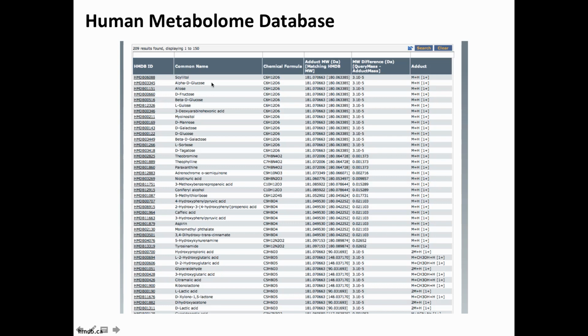Now, using glucose is also a mean compound in that respect, because all the hexoses will have exactly the same molecular weight. So you get plenty of candidates, but you see glucose is here on top, fructose, of course, glucose, mannose, galactose, and so on. So everything you would expect, but also a few unexpected things. Theobromine is also here. Aspirin is in the same molecular weight. And you see this is sorted by mass deviation. So as you go down this list, it just becomes less and less likely that you have the right hit.